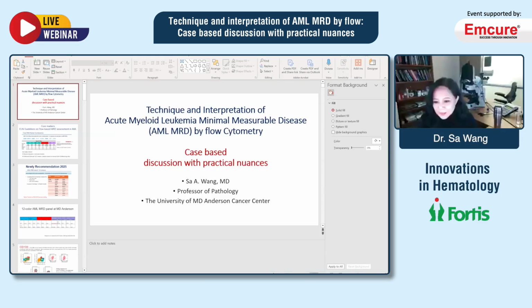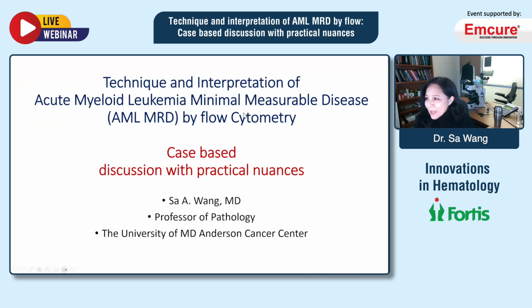Thank you, Dr. Gupta, for the introduction. I have been giving this topic a little differently from the usual AML-MRD talk I give in other places. I was asked to talk about the technical interpretation of AML-MRD by flow cytometry, and to do some case-based discussion with the practical nuances.